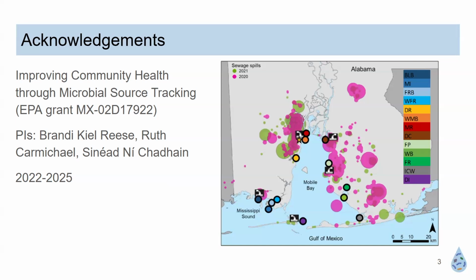I then combined that with quantitative PCR, which was under the direction of Penny Dimitri here, focusing on Bacteroidales, and then thirdly on eDNA, which is much more advanced, but also we hope that it's very tractable. And from there, combining these data sets, which is what we're in the process of doing at the moment. So I'm going to turn this over to Penny to kick us off for the rest of the day, and I'll be here to, of course, answer questions and to assist in any way.